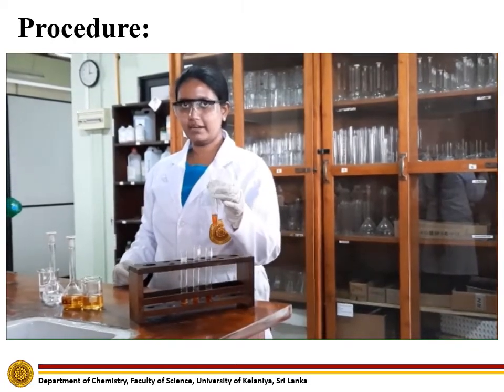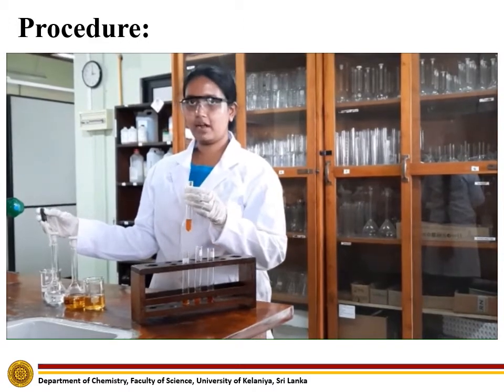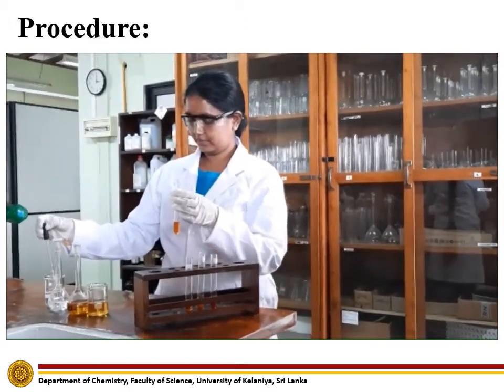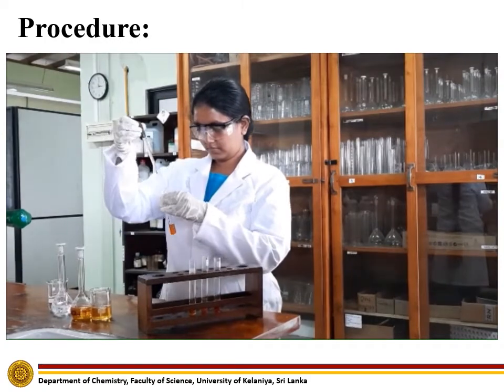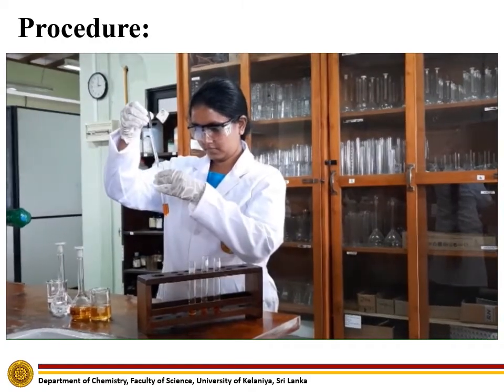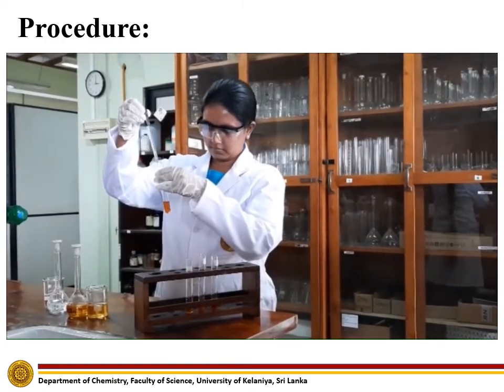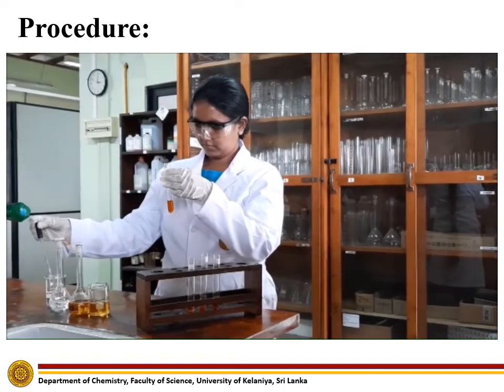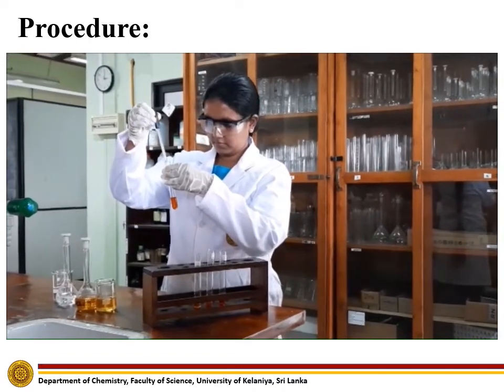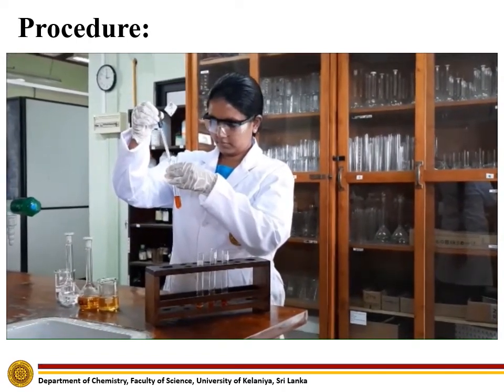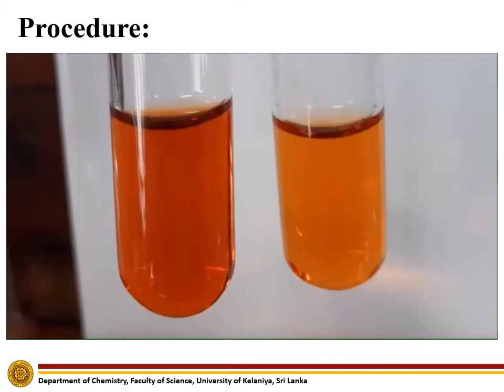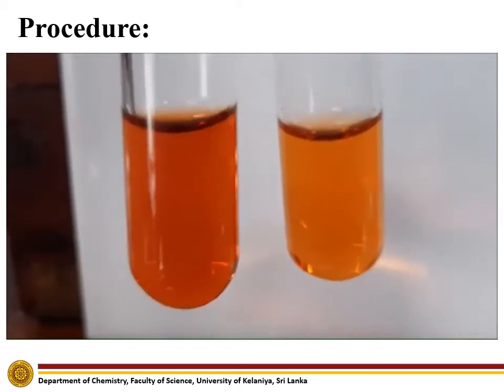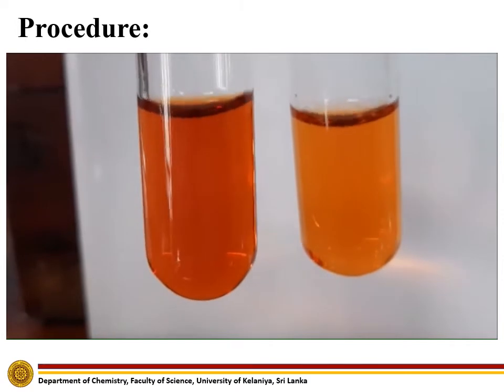To the final test tube, add 10 drops of potassium thiocyanate solution. Compared to the control, the fourth test tube also turned into a red color solution.